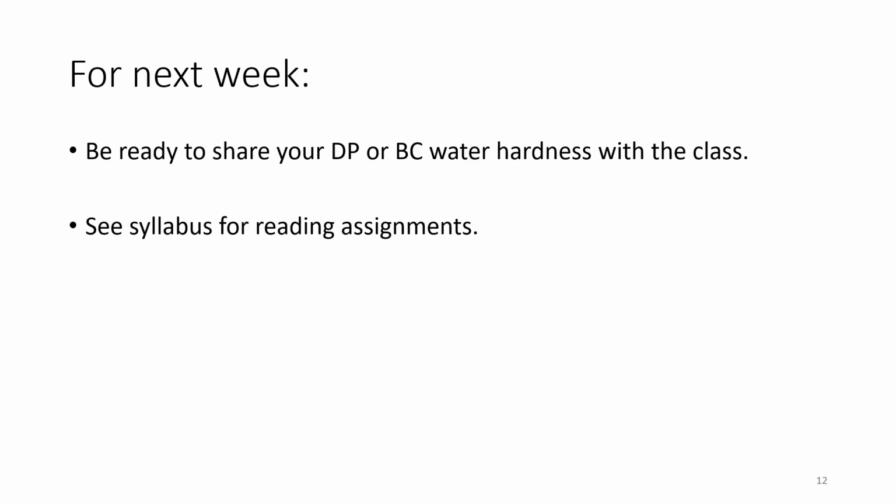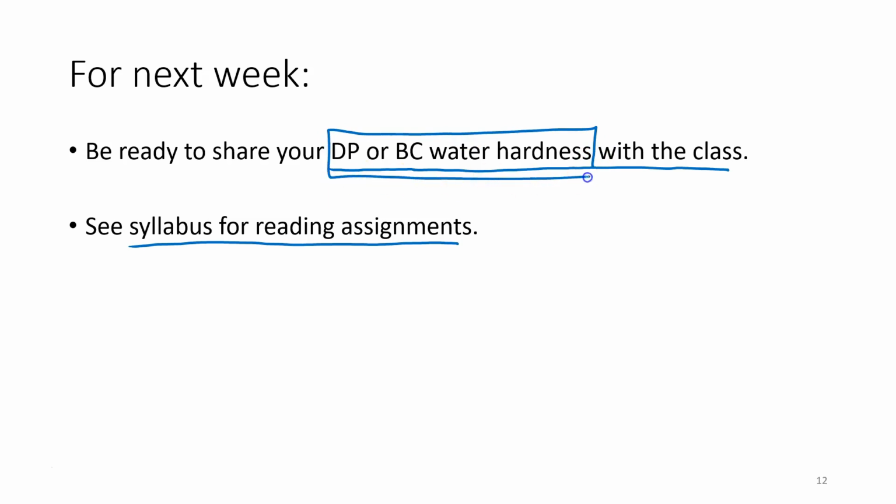And for next week, be ready to share your Duck Pond and Boone Creek water hardness values with the class, and then I'll ask you to see the syllabus for the other reading assignments that you have to complete. No report next week, I just want you to do your water hardness calculations on Duck Pond and Boone Creek for next week. And just as a reminder, in this experiment, the calculations do not involve a calibration curve.